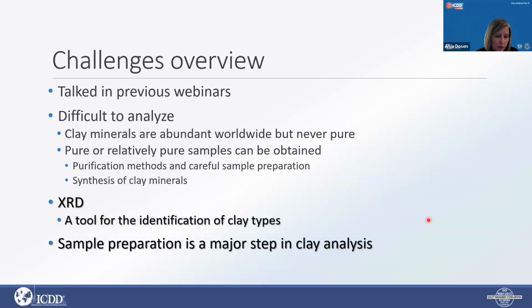So we've talked about challenges, but we're going to talk about this again. Clays are notoriously difficult to analyze. They are very similar. They're never pure. So when we try to analyze clay, we want to make an effort to analyze as pure a sample as possible.